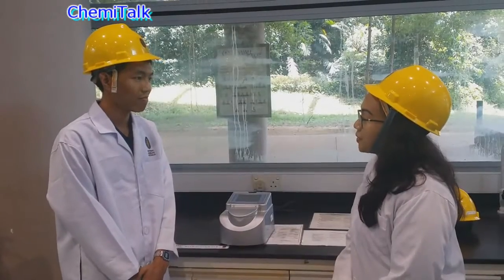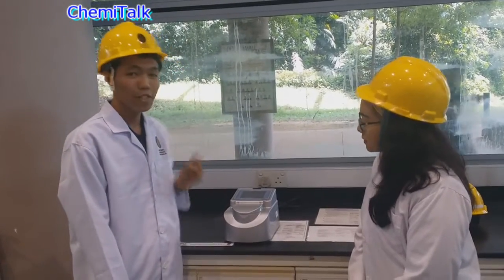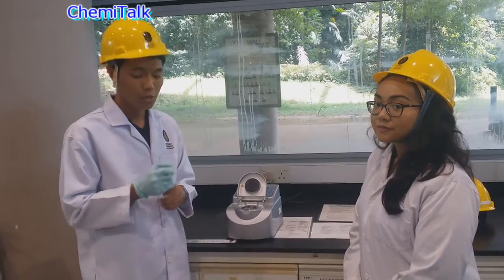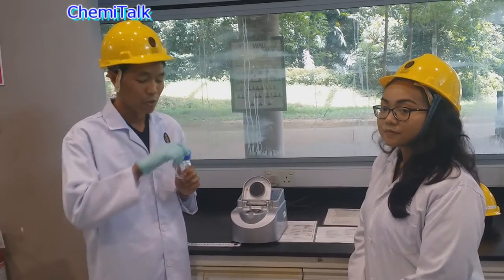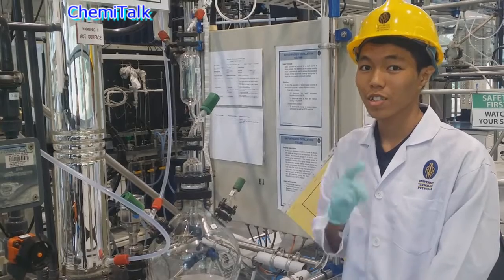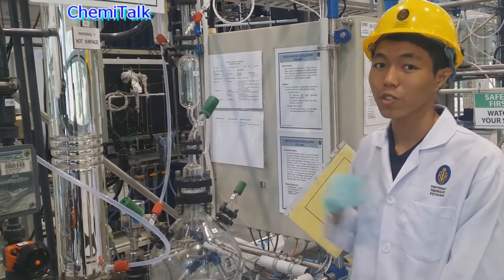Mr. Hafiz, may I know what are the errors and recommendations of this experiment? Okay, in this experiment, we use a refractometer. It is important to clean the refractometer every time after the refractive index of each sample is measured. Also, for every sample that we have collected from the distillation column, we have to close the vial tightly because ethanol evaporates quickly at room temperature. And also, every time we want to take the measurement of the liquid level, we have to make sure that our eyes are perpendicular to the liquid level to avoid parallax error.